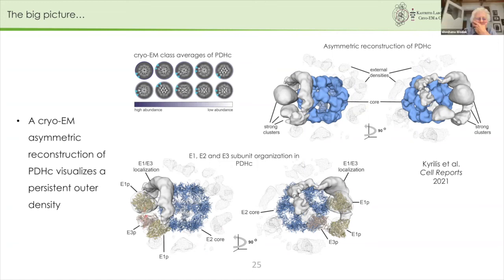So these are two proteins that should not interact with each other. This is a pair that we know is a negative interaction. And you know that there is no other density that is hidden, and the entire sequence is in there? No, it's not. It's only the folded domains. So you have these ordered regions which could still eventually interact. Okay.